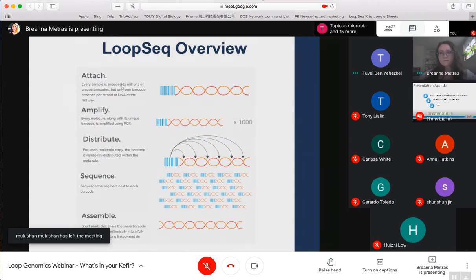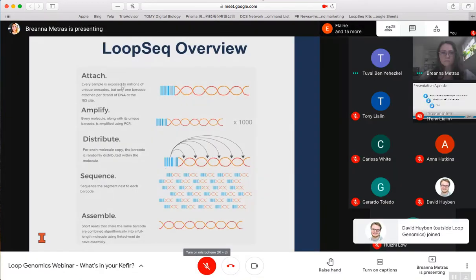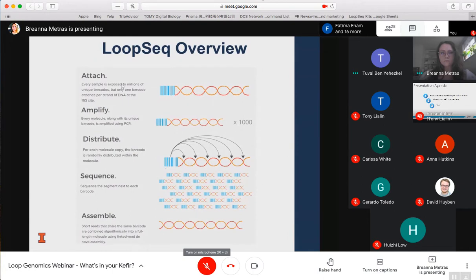Starting from the very top, where it says attach, every LoopSeq sample preparation procedure starts by attaching a UMI, a unique molecular identifier, to every long DNA molecule. In this slide, that's the blue barcode-looking element on the DNA molecule on the top. A unique molecular identifier is simply a sequence of DNA that provides a unique address, written in DNA sequence, to each DNA molecule in the sample. Imagine that on the top there, we have full-length 1500 base pair V1-V9 16S molecules, and we're attaching one of these UMIs, these unique addresses written in DNA, to each and every molecule in the sample.